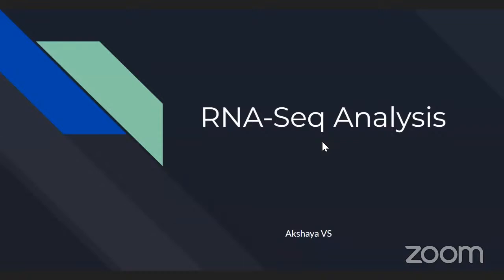Whereas in single cell RNA-seq, a single cell is isolated, and then only that is PCR amplified and sequenced, and a bunch of analyses are done on those. Today we're going to discuss RNA-seq from the viewpoint of bulk RNA-seq analysis, because this is what I've been dealing with.